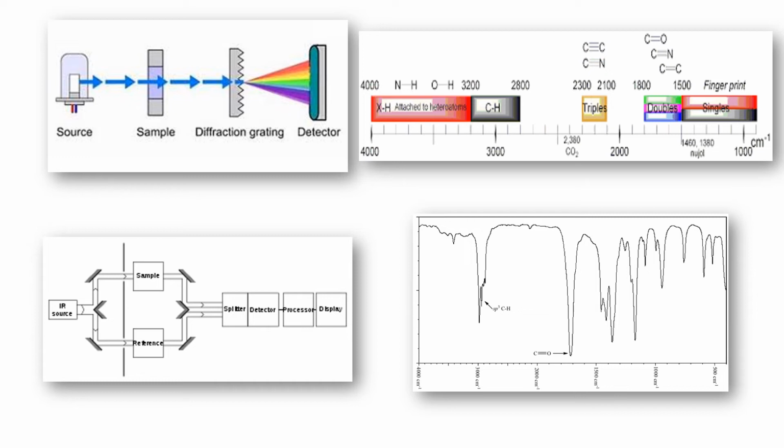These are typical spectra for IR, the IR spectral lines. This big symbol denotes the absorption spectra. You compare the wave number, and a particular element is presented here. From this, the compositional studies, also called structural studies, and the composition of our particular sample are discussed by using the spectra.